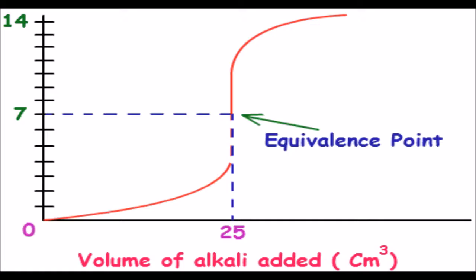In this graph, it shows the equivalence point. The equivalence point is a point when pH is neutral. It means that the amount of sodium hydroxide is equal to the amount of hydrochloric acid. But in this lab, we use phenolphthalein as a pH indicator. So we have to use the endpoint instead, because phenolphthalein changes color when pH is around 8.4 to 9.0.